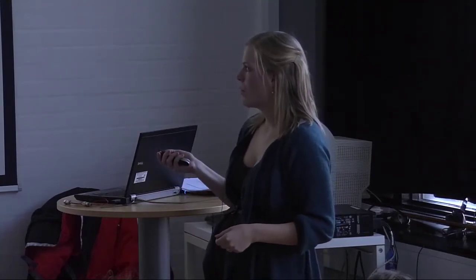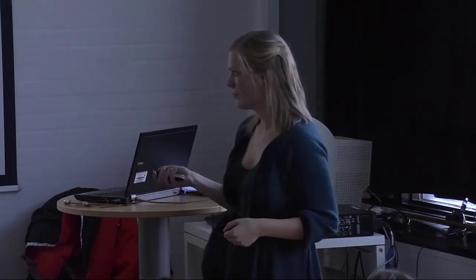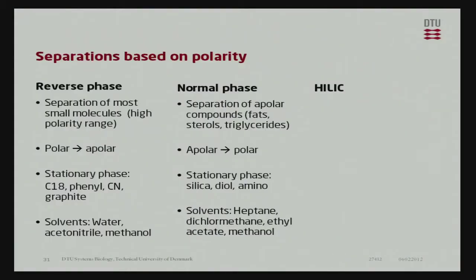So again, we use silica, but we can also put just some hydroxyl groups on the silica, call that diol, or amino groups. So all these polar groups we can stick on the silica and attract likewise polar molecules. The solvents that we use for this are a little bit more harsh. So we use heptane, dichloromethane, ethyl acetate, and methanol. So these are the apolar solvents.